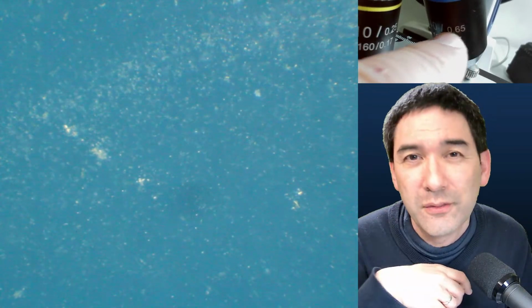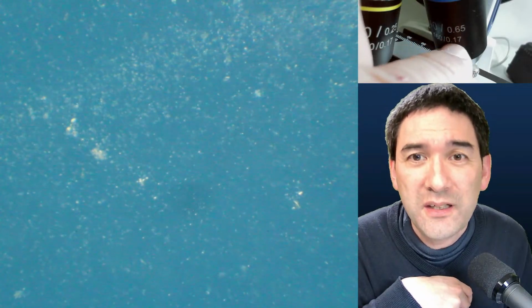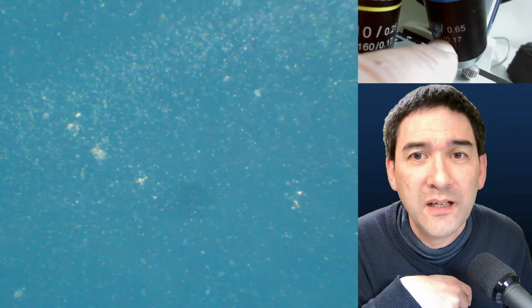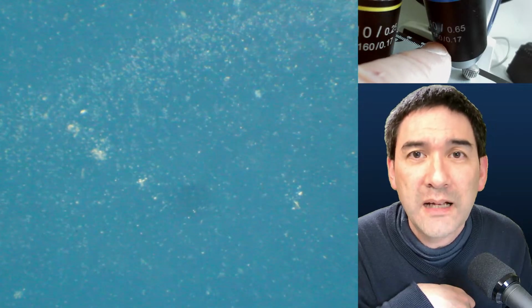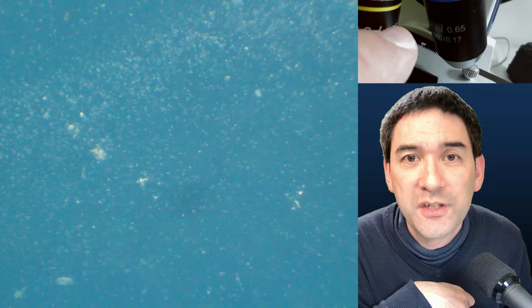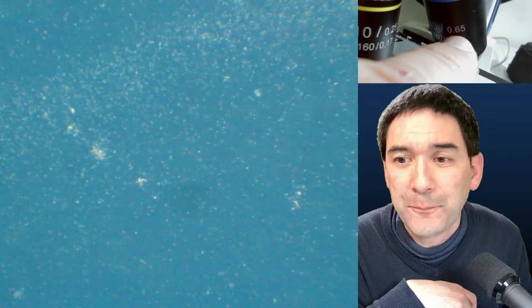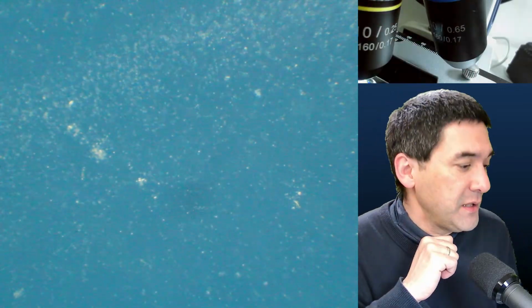That's theoretical stuff, yeah, not super important for amateurs. The 0.17 is the thickness of the cover glass, and the 160 is the mechanical tube length. That's kind of the standard. But the number here, the 0.25 or 0.65, determines the resolution of the objective. Yeah. So that's basically what I wanted to show.